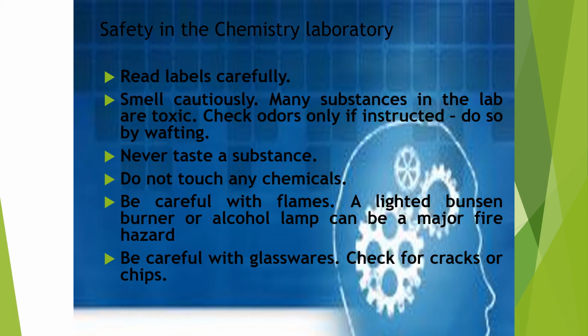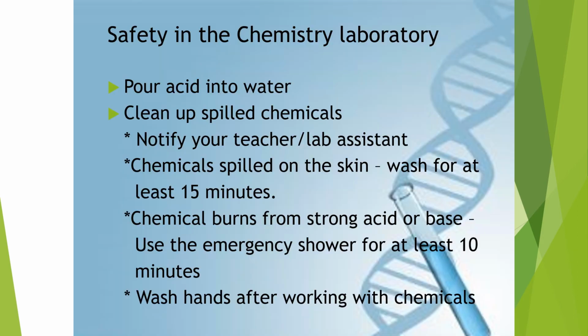And be careful with flames. If you're using a lighted Bunsen burner or alcohol lamp, that can be a major fire hazard if not attentively used. Be careful with glasswares. Check for cracks or chips. You don't pour water into acid. Pour acid into water.